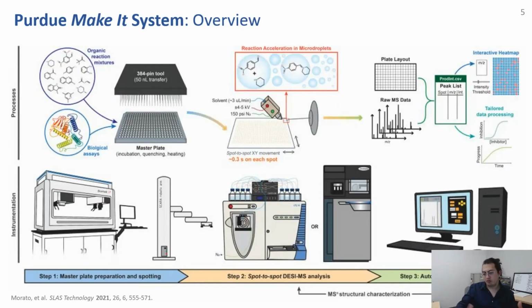Eventually, once you finish your plate, you have a huge amount of spectral data that you have to process. When the user starts this whole workflow from the fluid handling workstation, they also input a plate layout, which basically contains what you put in, what you are looking for, and which m/z values you are interested in for each one of the wells, for each one of the samples.